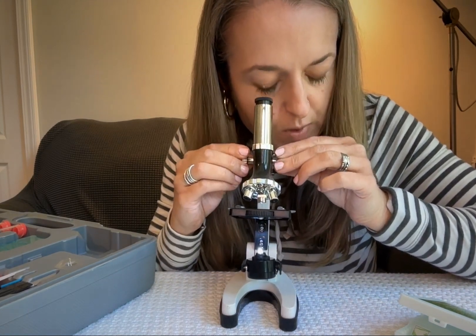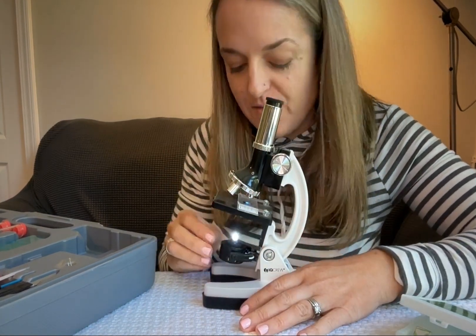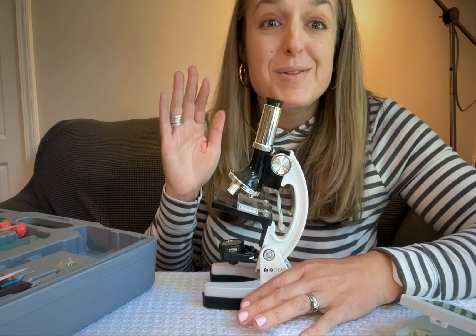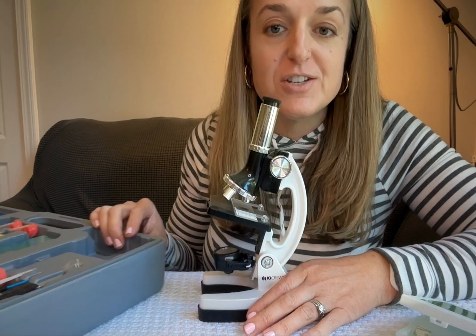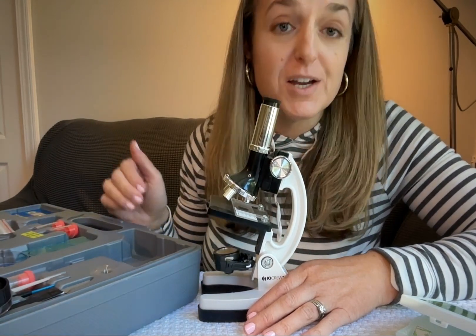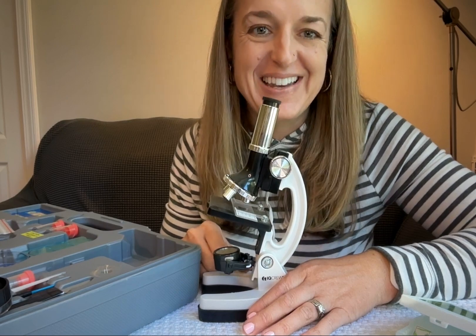This is a great tool, especially for kids who are just starting to discover the world of the microscopic and getting curious about their world. This kit has basically everything that you could dream of for a young explorer, so it's a really great set and I do highly recommend it.